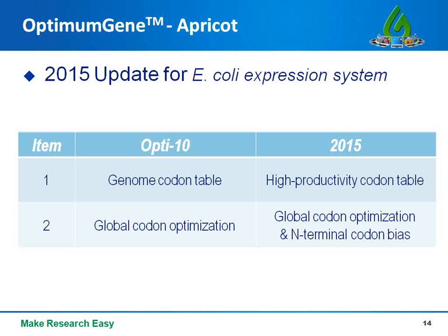And in addition to performing global codon optimization across the entire CDS, we adjusted the threshold for accommodating N-terminal codon bias according to some recent research findings.